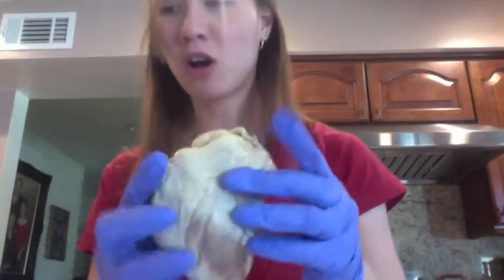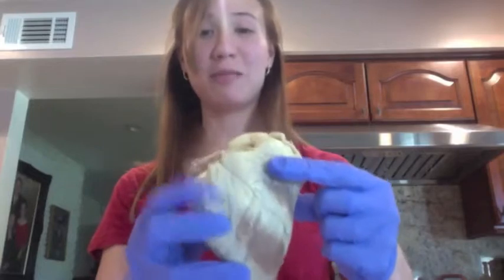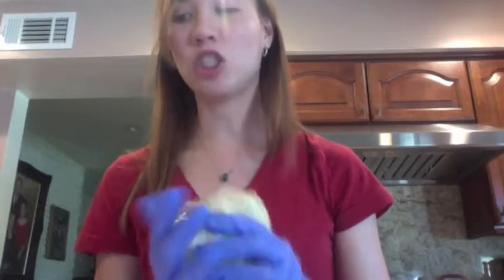We have our right and left atrium. This is my right, and this is the left atrium. The blood from the right atrium is deoxygenated blood, and the blood in the left atrium is oxygenated blood.